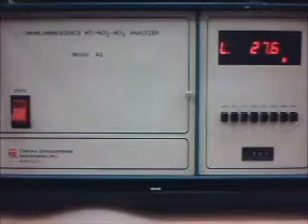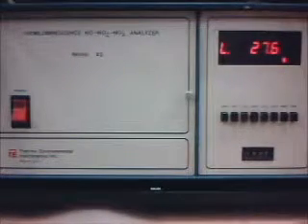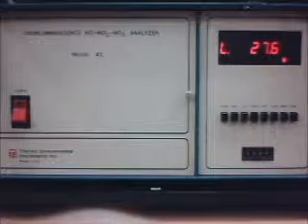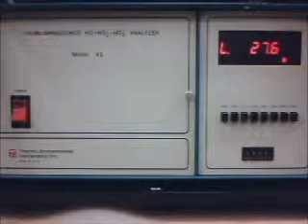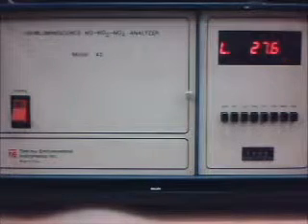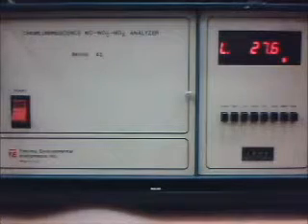So basically, like I said, I just wanted to go through these push buttons and try and describe what I know that they do. So the first push button, this one, is REM. It just stands for remote, and that allows for setting different aspects of the instrument remotely through the wires in the back, I guess.